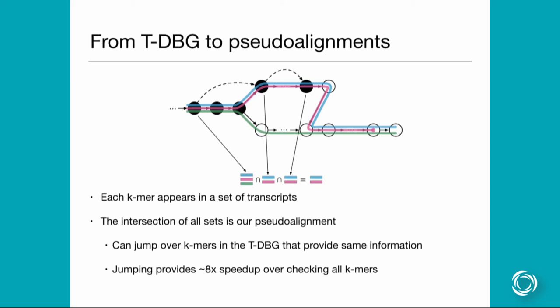Yes, so we have some ideas on actually how to identify SNPs. But I will say that if you're interested in SNPs, none of these pipelines will do that anyway. Your typical Cufflinks algorithm, you could have SNPs all over the place, and it just won't look at them, right? All Cufflinks cares about at the end of the day is that these reads are compatible with this particular transcript, and then it uses those counts to do this inference that we'll talk about in a minute.